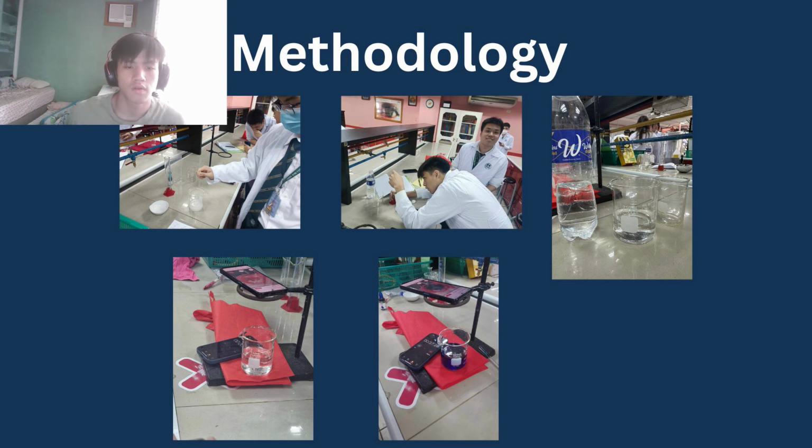An additional smartphone is placed beside the setup to record the time. While the smartphone on top monitors the RGB changes every 15 seconds, this monitoring starts when the red value in RGB exceeds 8, signifying the gradual loss of color in the blue dye and the solution's return to its original color.